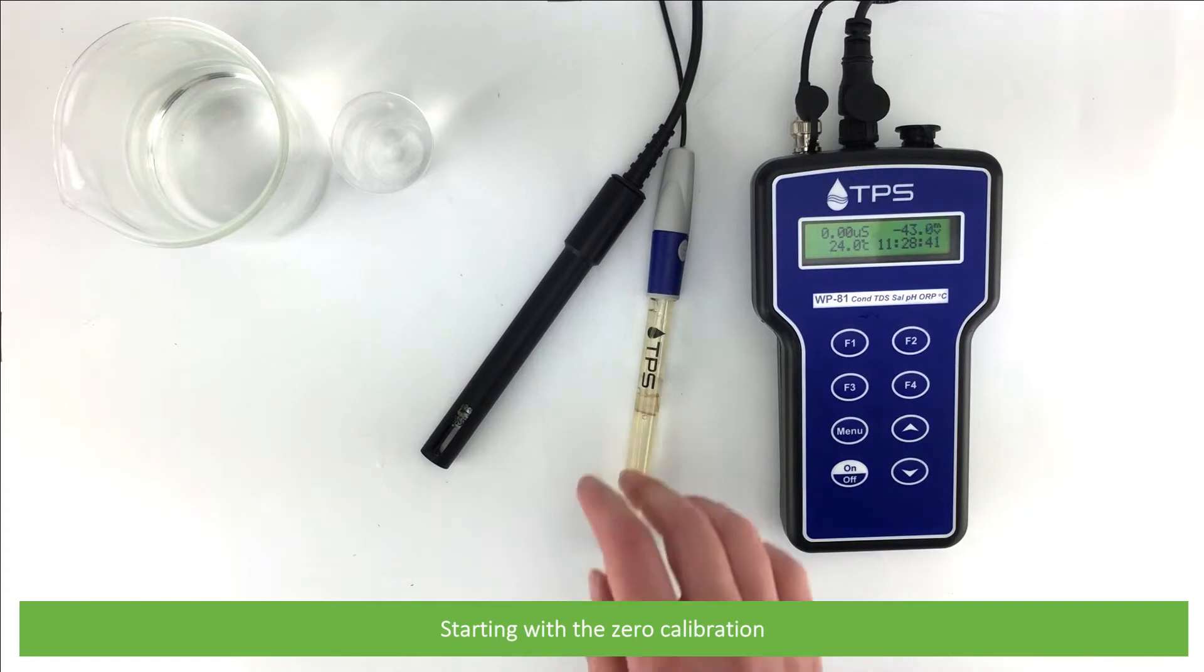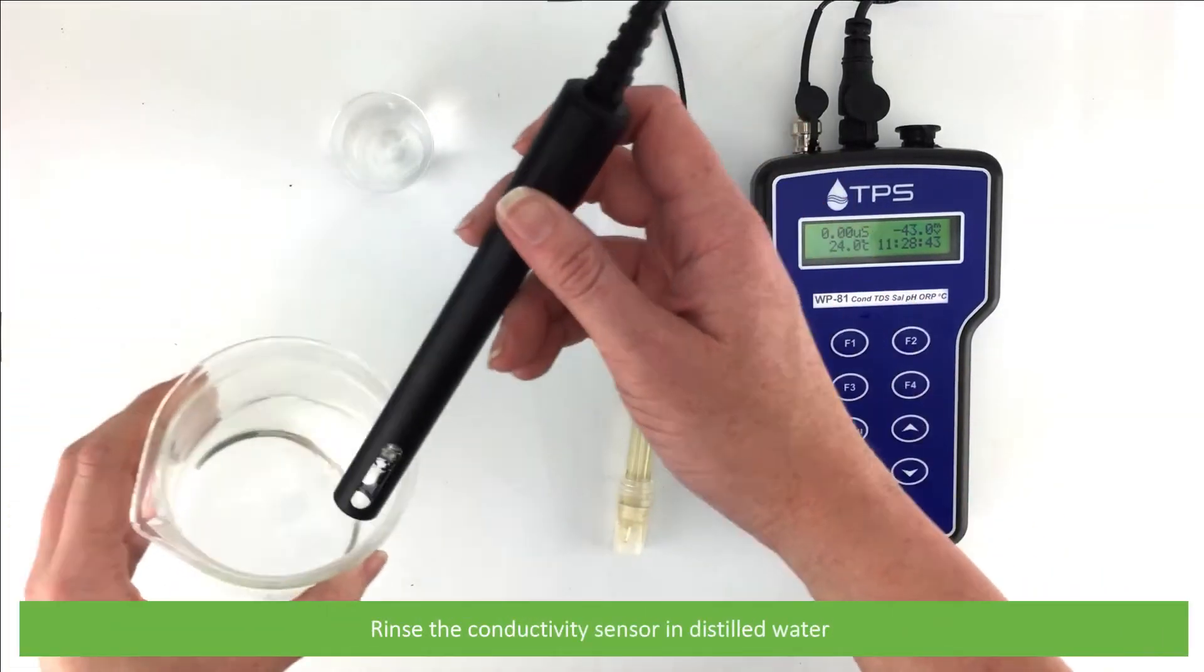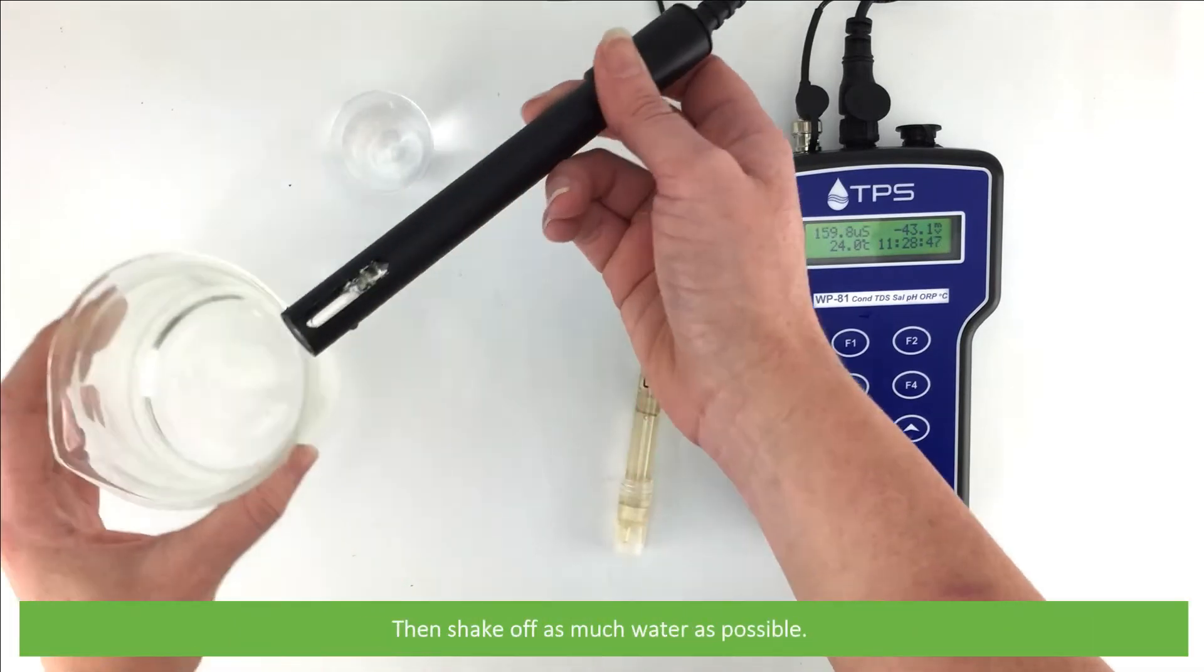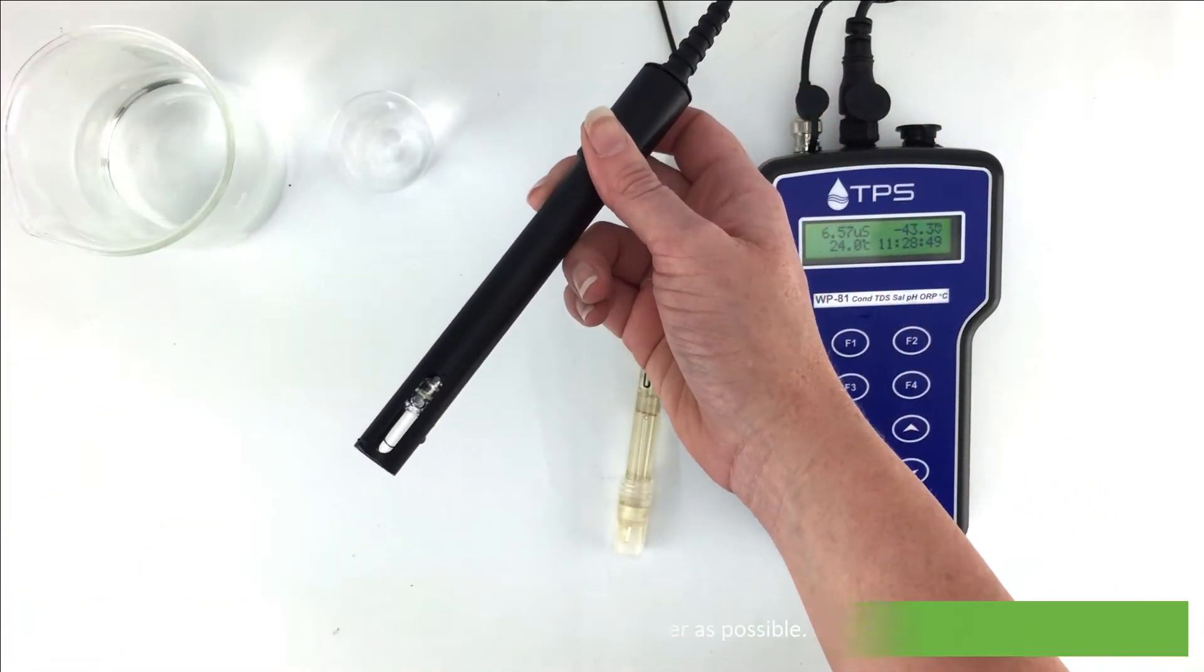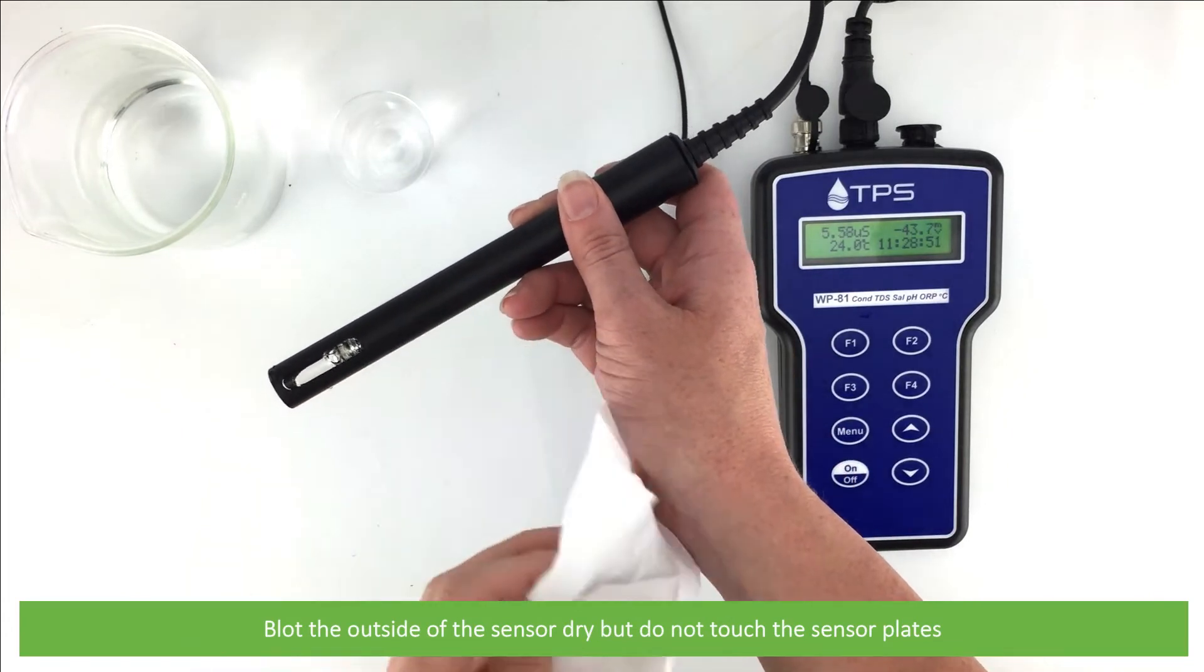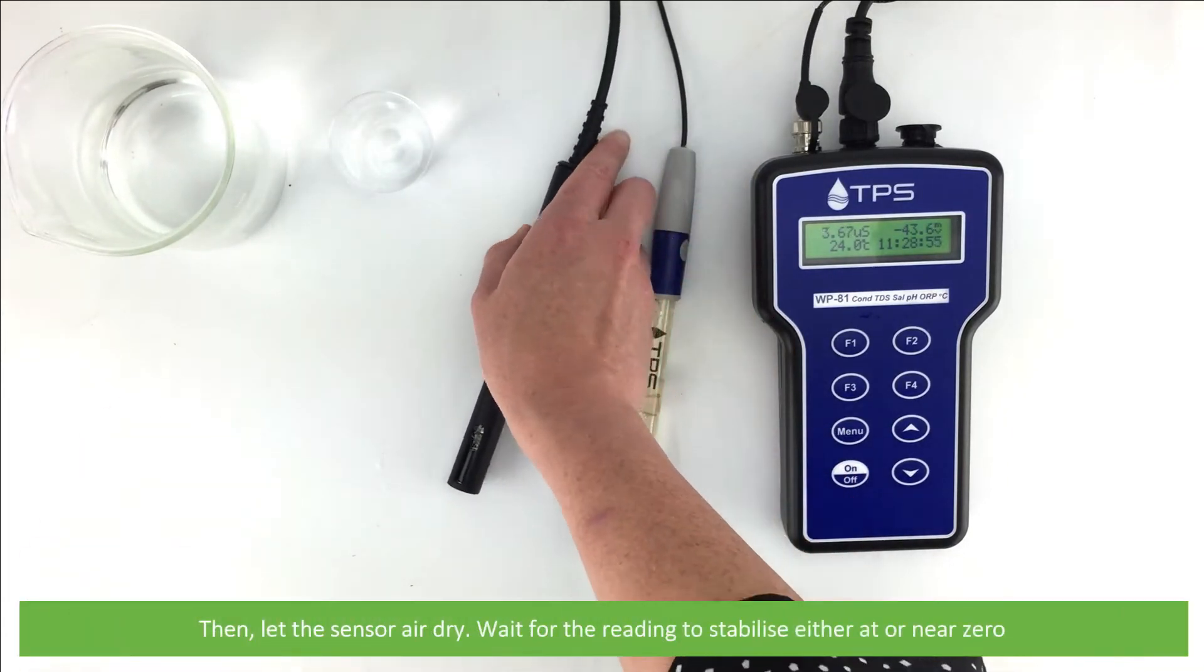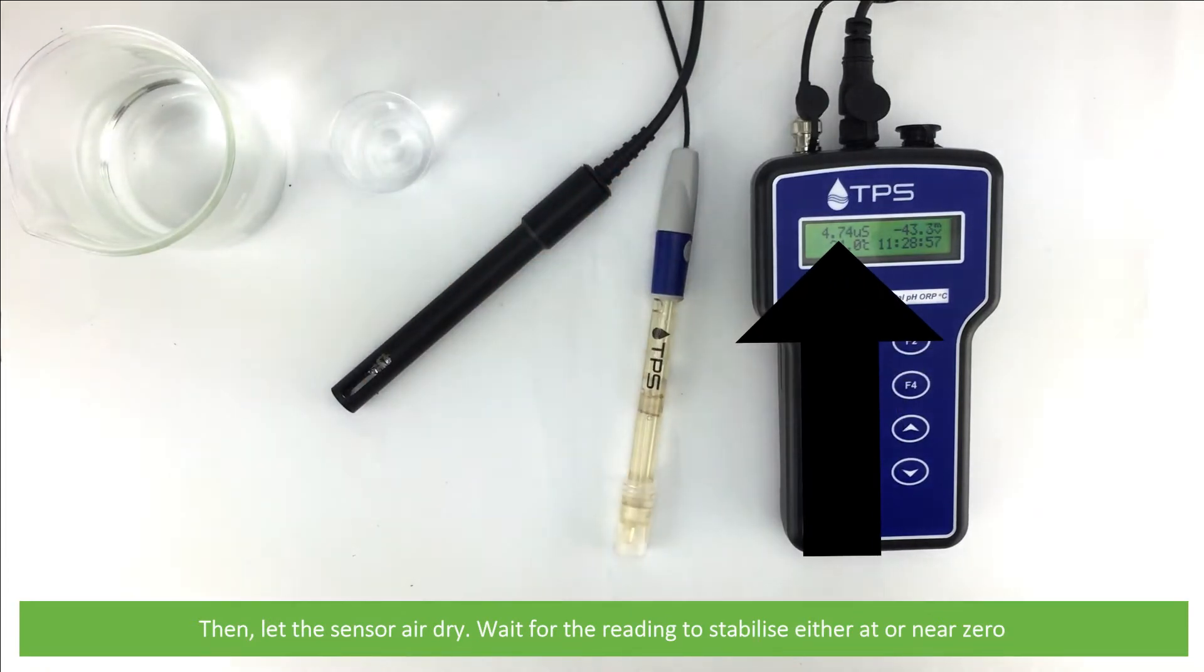Starting with the zero calibration. Rinse the conductivity sensor in distilled water, then shake off as much water as possible. Blot the outside of the sensor dry but do not touch the sensor plates. Then let the sensor air dry. Wait for the reading to stabilize either at or near zero.